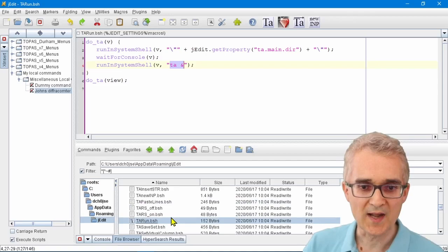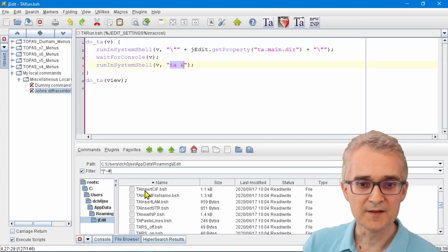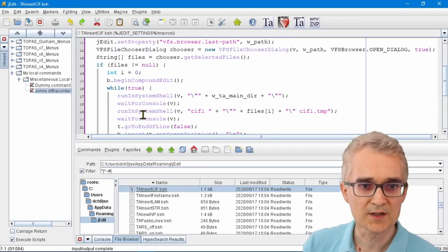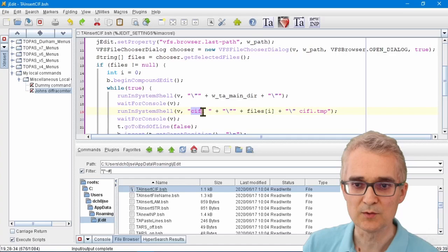The default routine is here. It's called TA Insert CIF dot bash, and the actual work is done on this right line here. When you click on that button, what happens is it runs a program called cif_one.xc on a temporary file.